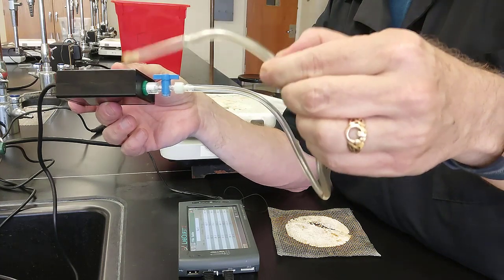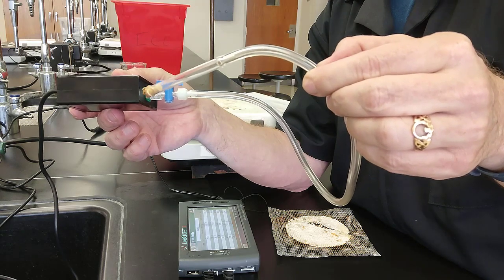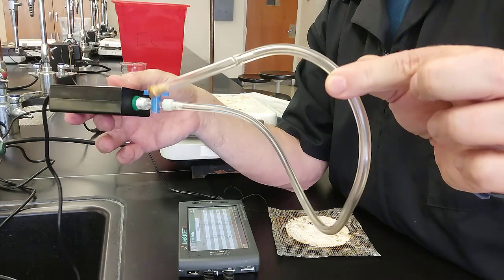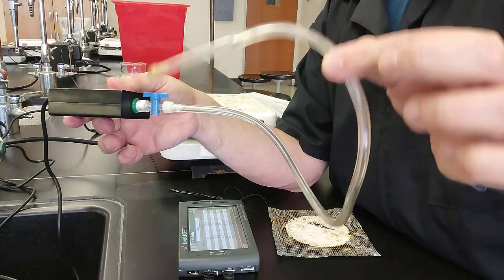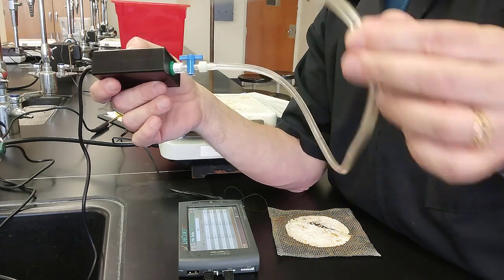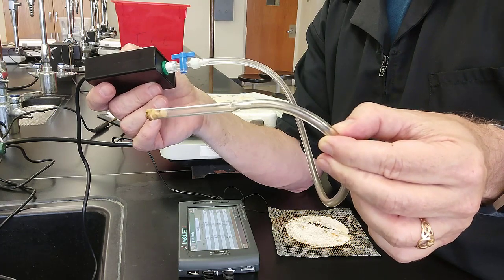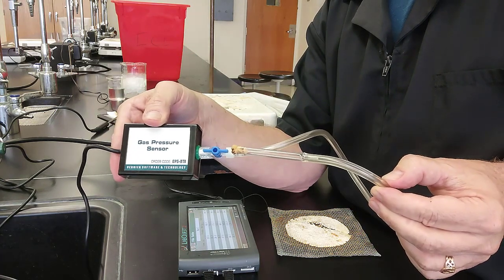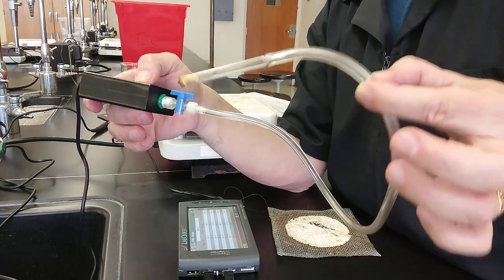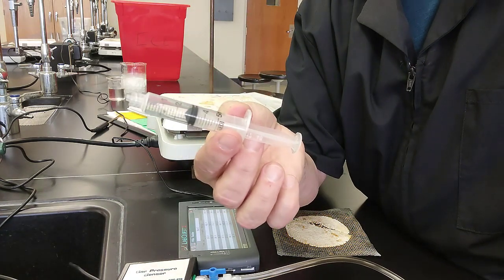Okay? Getting this hose to blow up like a balloon would take a lot of pressure change, and we're not going to do that radical of change. So this is a constant volume, so what we can do is change the temperature of this glass by putting it in ice or putting it in hot water and see what happens to the pressure. So we're not changing the amount of gas in here, just like we didn't change the amount of gas in part 1 when we adjusted the syringe, right?